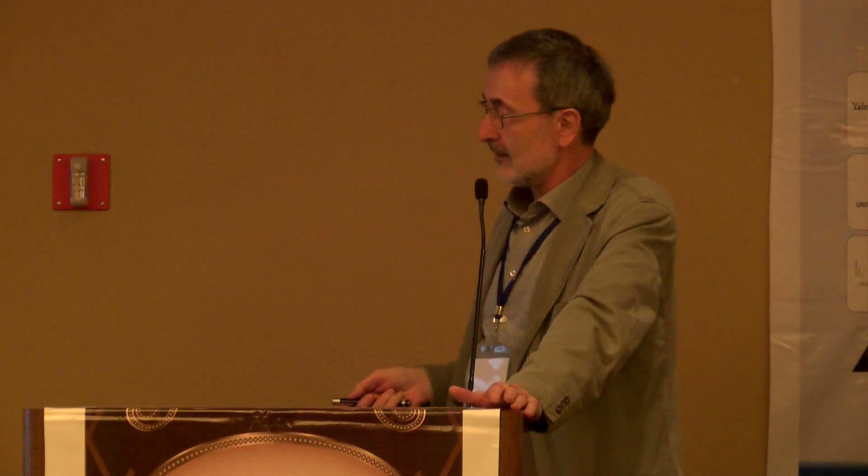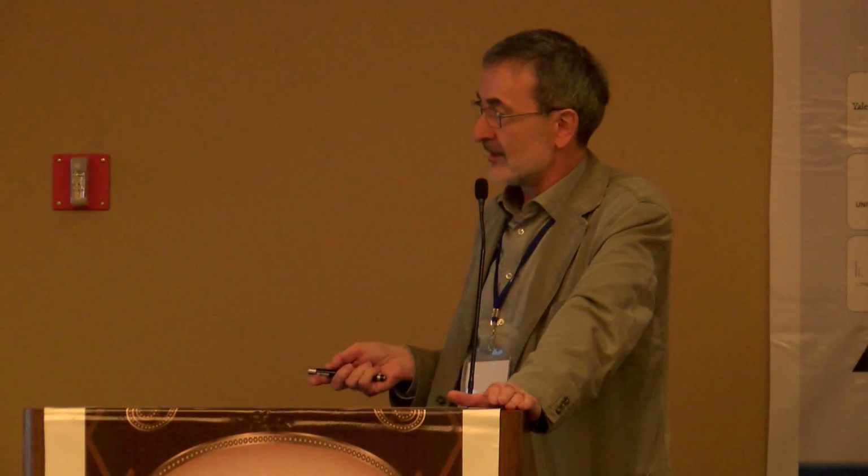And of course, we were interested in what happens in this bark tissue and what the contents of these specific cells are. So we were cutting two types of cells, these so-called stone cells, and also the phloem parenchyma cells, which occur in rows and which are filled with some sticky material upon infection. And we also cut some control tissue. And this is again the procedure.